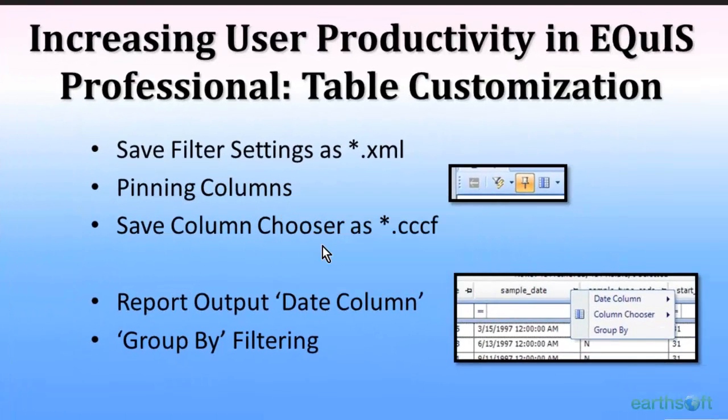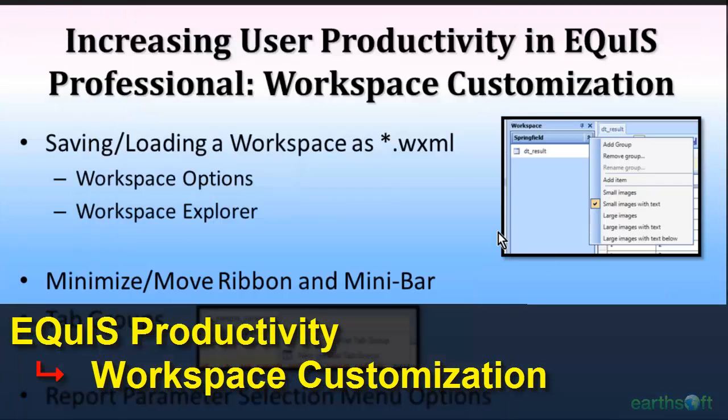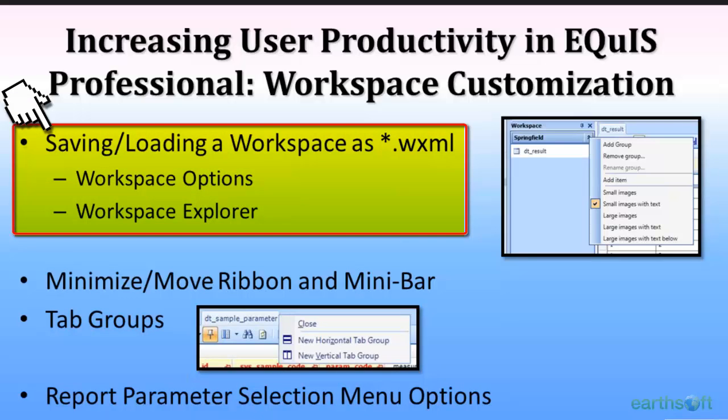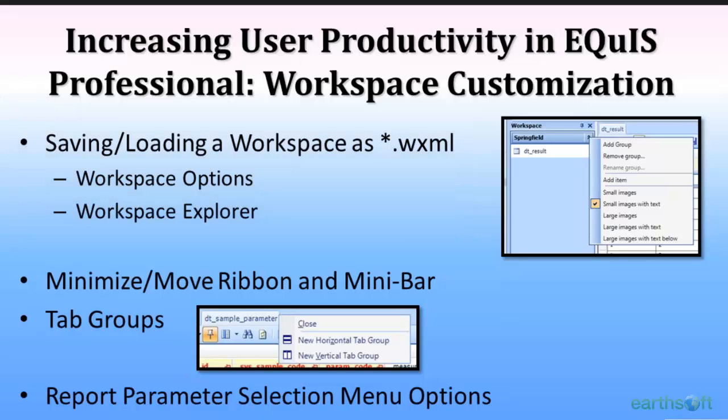So the last thing we're going to discuss is our workspace customization. Whenever you have a group of tables and reports and a form, for instance, open, you can save those as a workspace, close down EQuIS, and reopen it, open that workspace, and load everything you were working on in your previous session. It's really nice to save time, to keep from having to open up a bunch of tables and reports again and again.